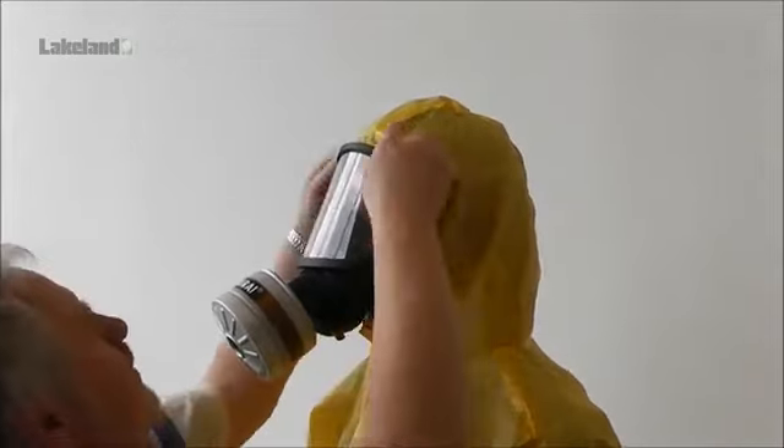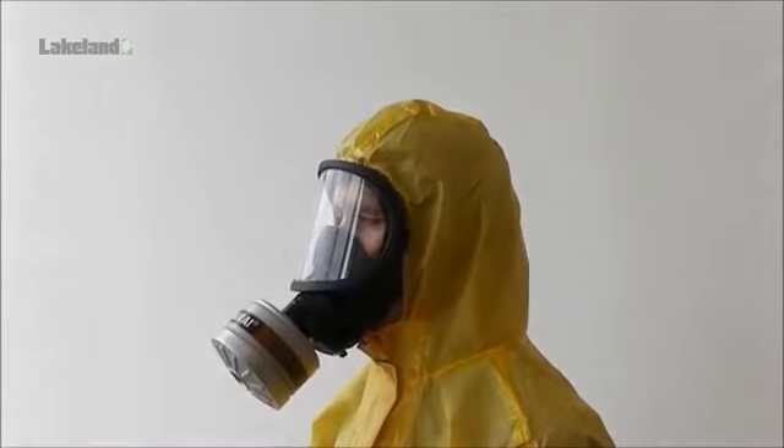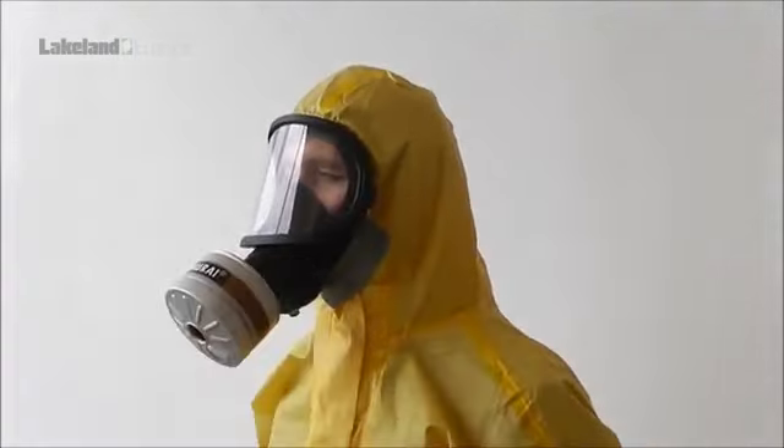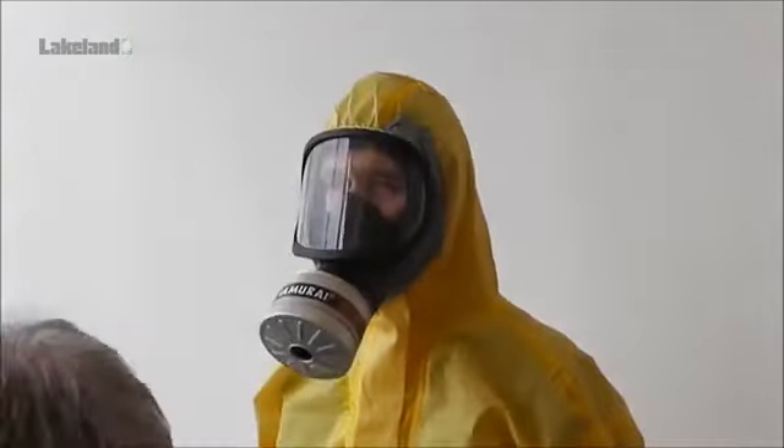Make a final check to ensure the hood fits well to the mask. In some cases, depending on the application, it will be appropriate to tape up the joins between the mask and the hood.